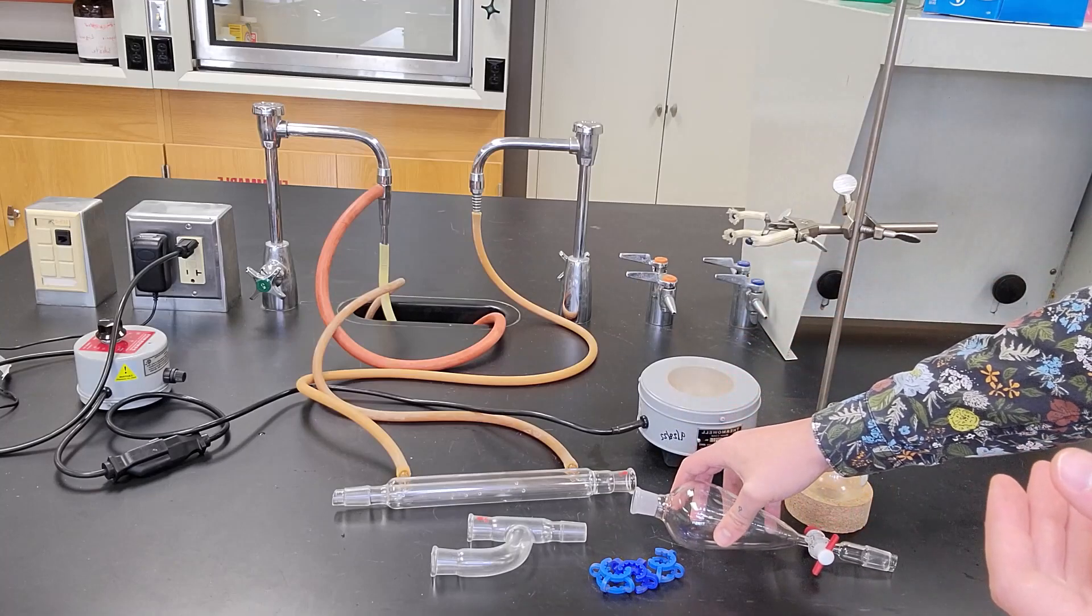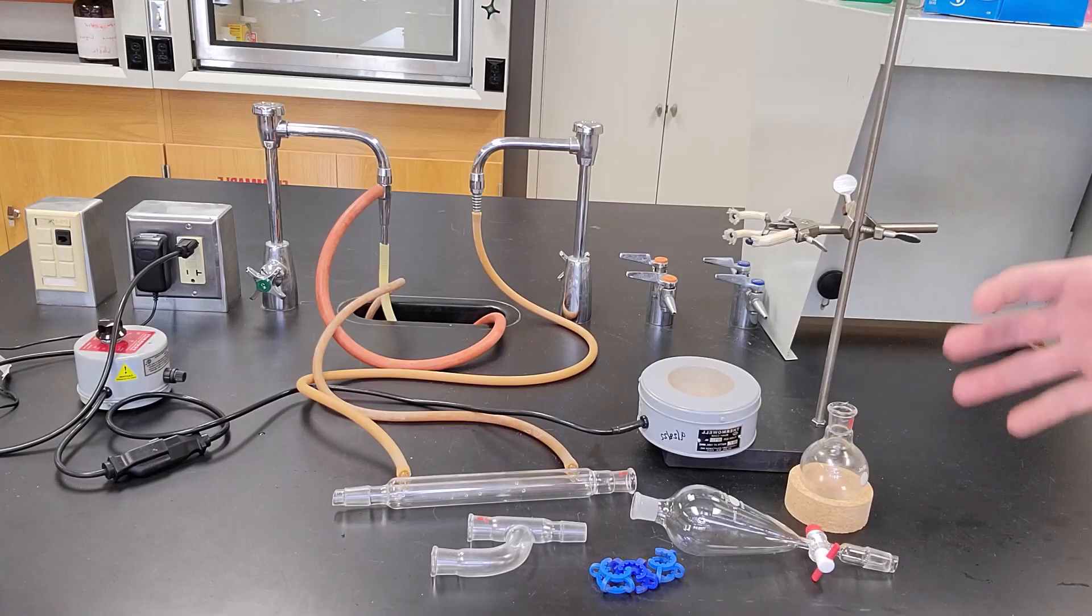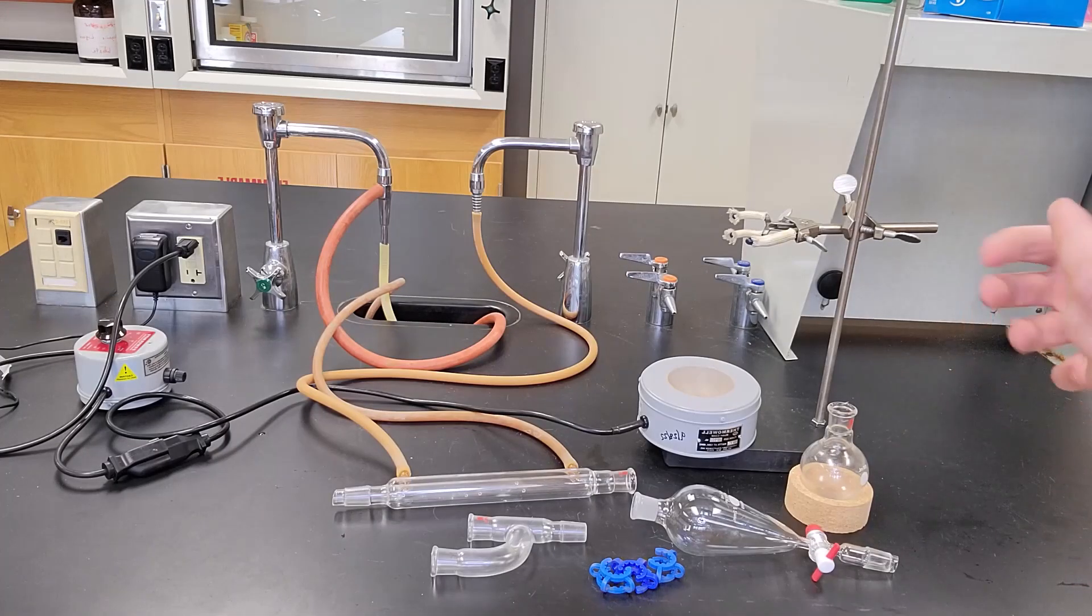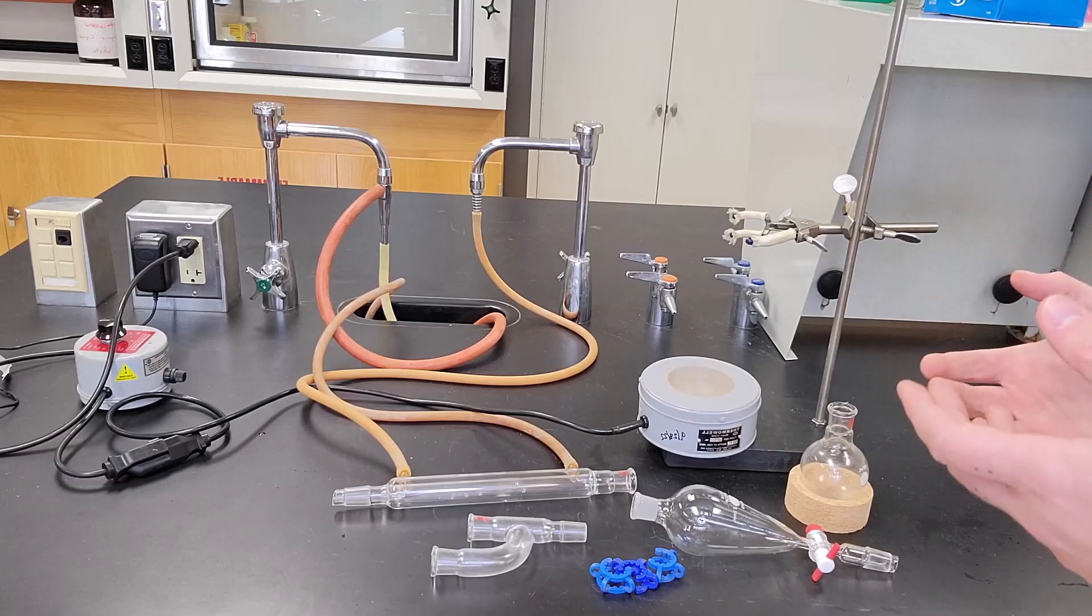Addition funnels are very useful when we want to be controlled and even about the addition of a solution or a liquid or a solvent to a reaction mixture. Say we want to make sure that 15 milliliters of a solution gets added to the reaction mixture over the course of an hour. We can set an addition funnel to have a slow dropwise addition so that, say it's exothermic, it doesn't overheat and boil over. We have the added safety net of having a reflux condenser in this setup.